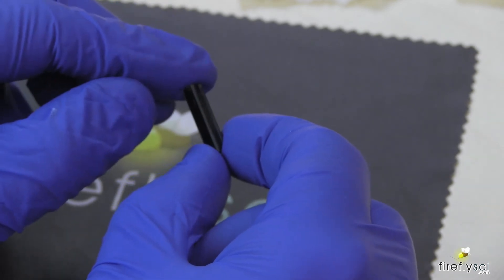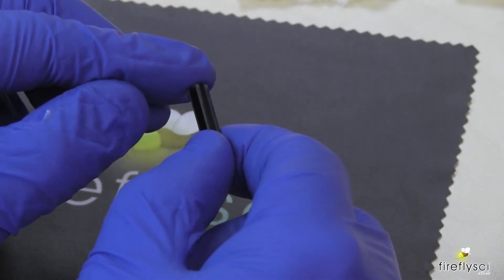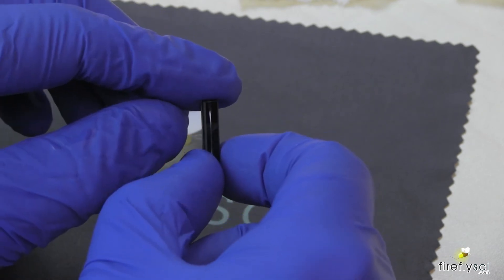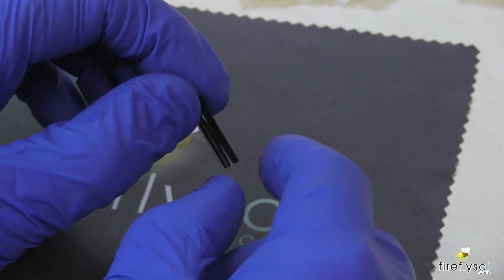This one is a combination of clear and black quartz. The black quartz has masking properties to help improve transmission.